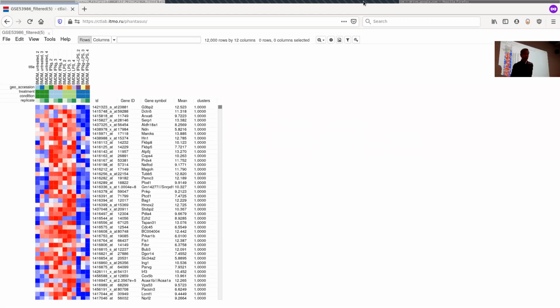Yeah, so now we start with public datasets, and later, in the second part of today's class, we'll talk about how to load your data into Phantasus. So we'll go back to it a little bit later. Okay, but for now, thank you.